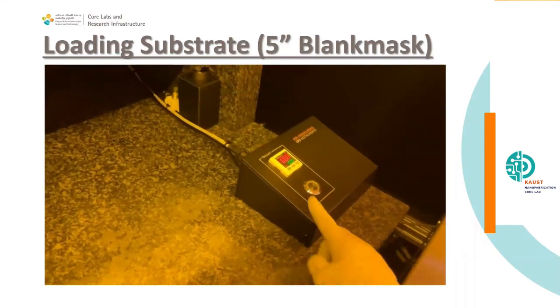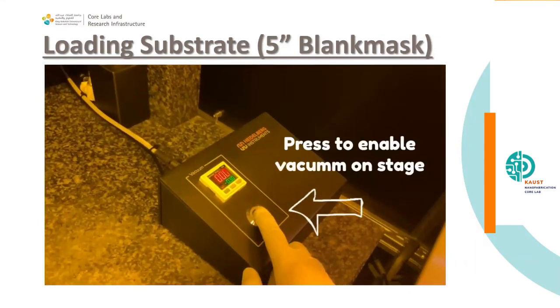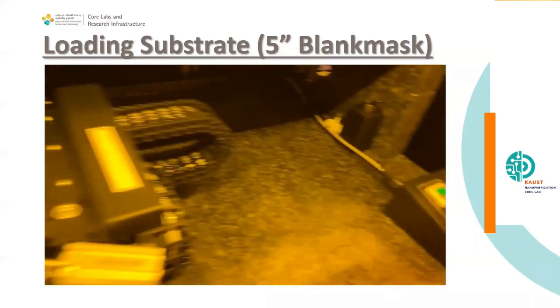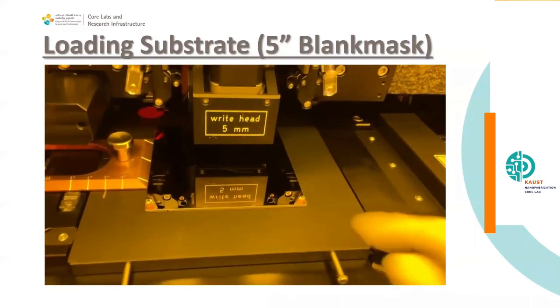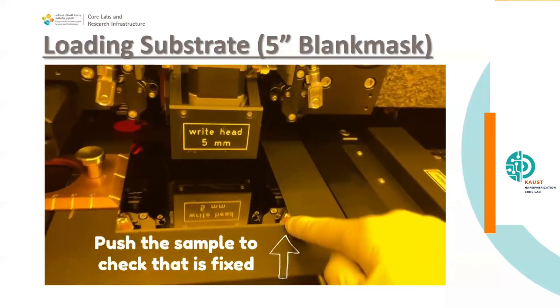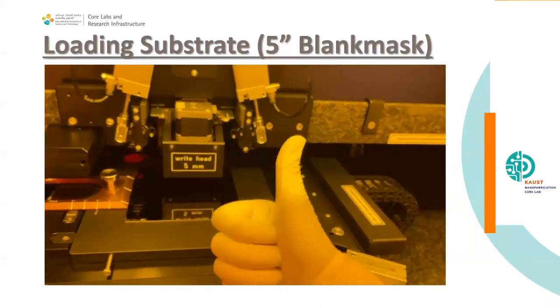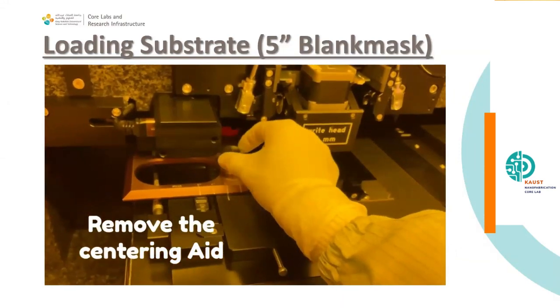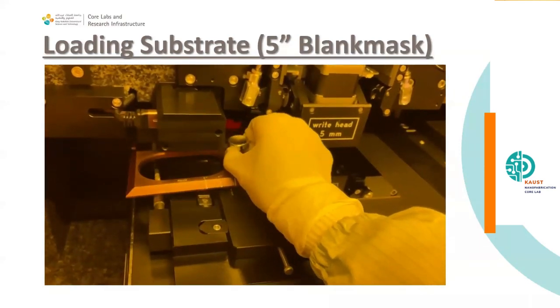When it's aligned, switch on the vacuum. Check that it's not moving. And then remove the centering tool.